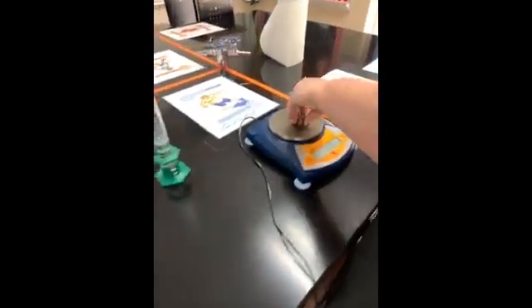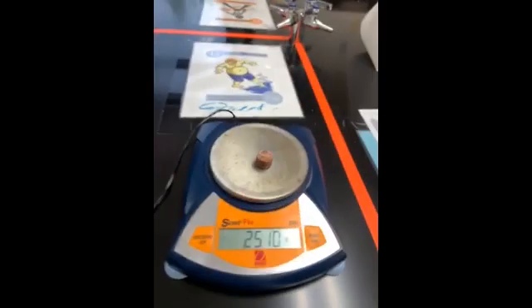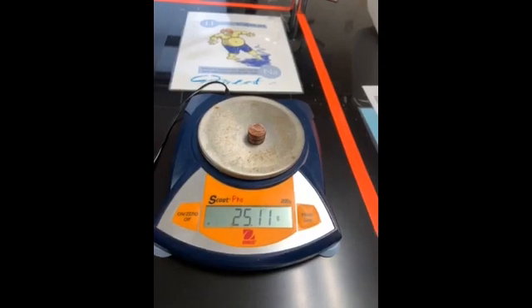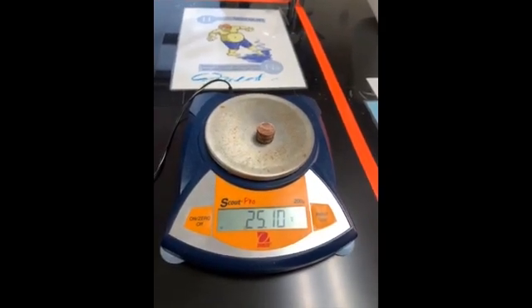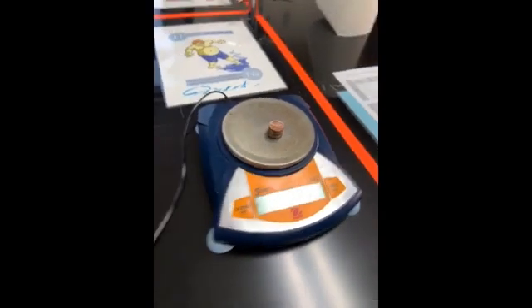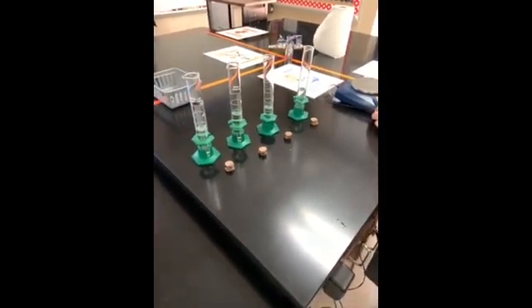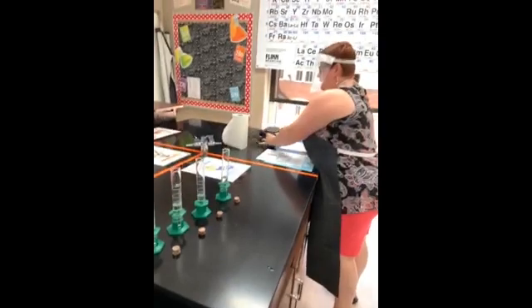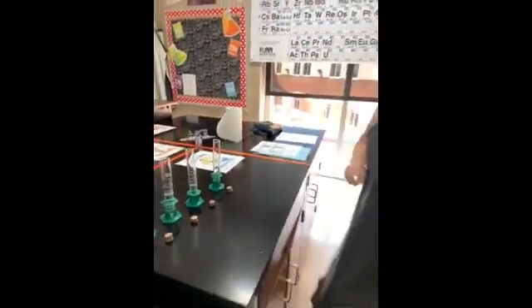And lastly, for the masses, trial 4 of post-82 pennies. Go ahead and get that written down. All right, so that's the end of our mass data. We'll go ahead and turn off our balance because we're done with it. I'm going to unplug it, set it off to the side so that it's not in our way, we don't trip on the cord or anything like that.